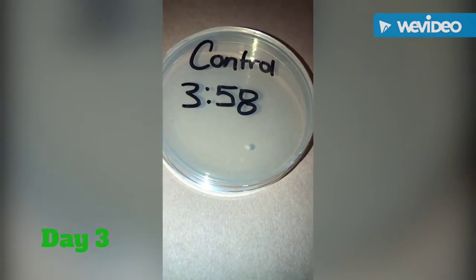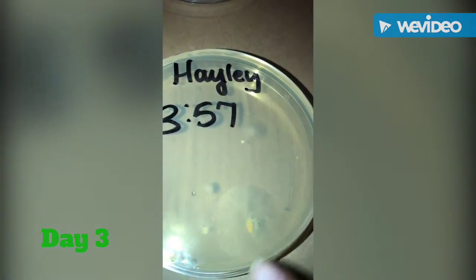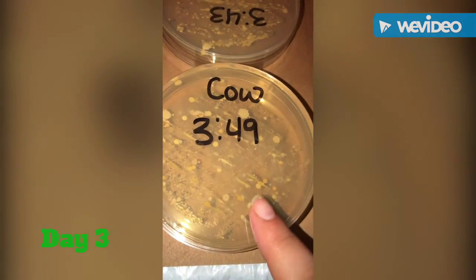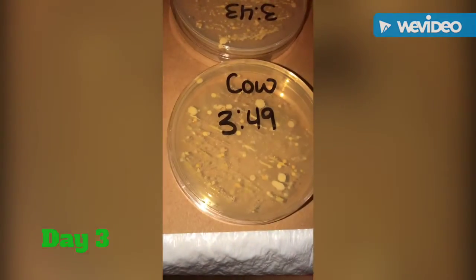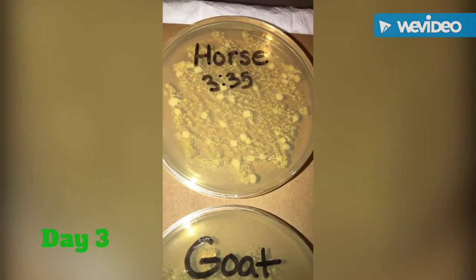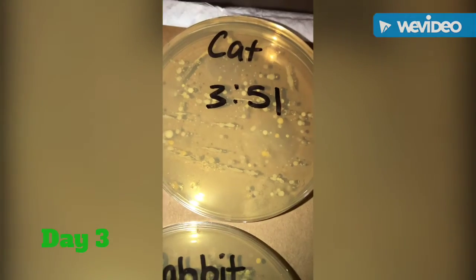Day 3. There's my control. There's myself. As you can see, there is some growing, but not very much. Here's the cow. You can tell that there are some big spots of bacteria. There's the goat. It's got a little more than the cow. There's the horse, and it's probably got the most compared to all 3. Cat, I mean, it's got some, but not as much as the horse.